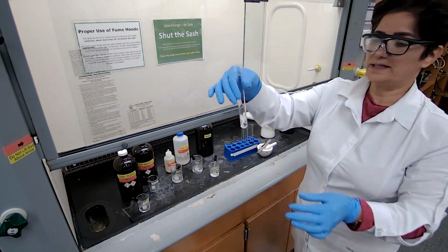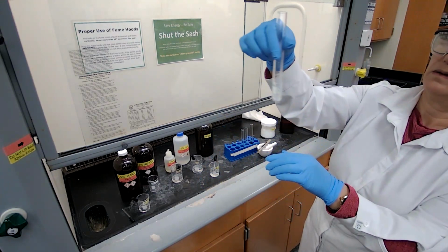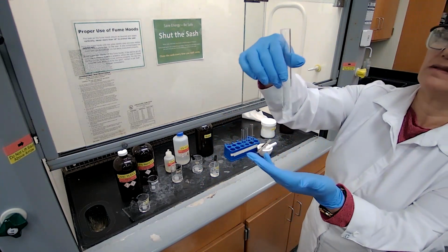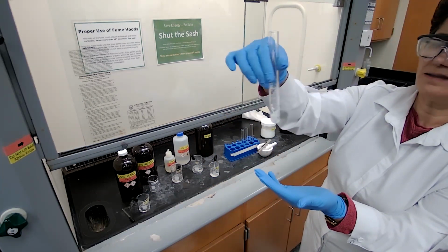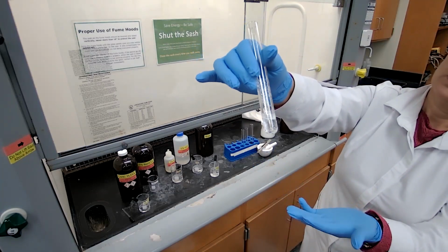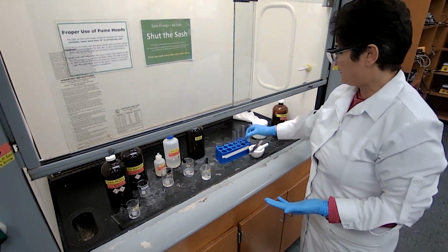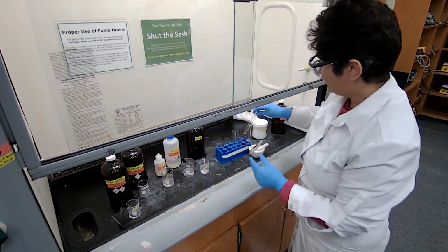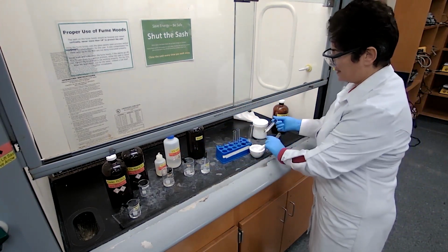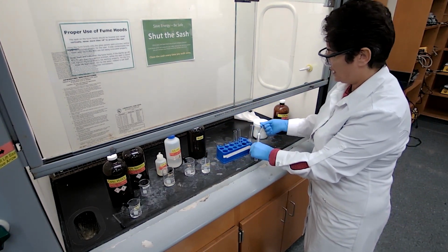Check for solubility in water. The powder stays on the surface and is not mixing or dissolving. You shake it about 10 seconds and check. This sample is not soluble, so we just record not soluble and move on to the next solvent. The next solvent would be HCl. If it does dissolve in water, we should not do any other solvent. But if it does not dissolve in water, next we check with HCl.